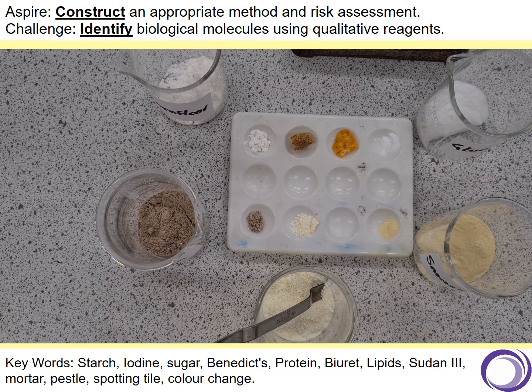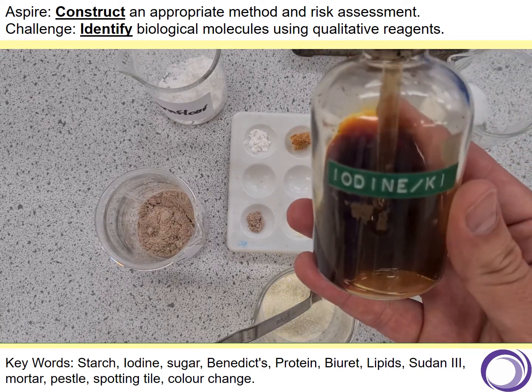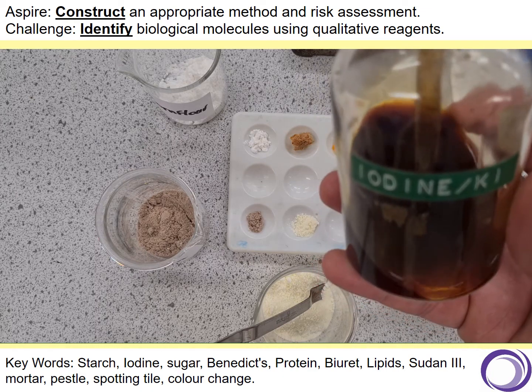Now, this is quite a common one because we used it in the magnification one when we were looking at cells using a microscope, and we also used this in the enzyme experiment. So we're going to use this thing, which is iodine. Now notice it is brown at the moment. If you see that liquid there, it's a brown. If starch is present, it should turn black.